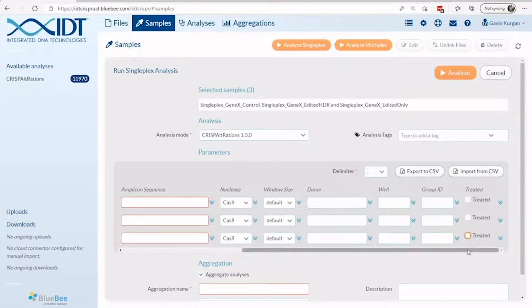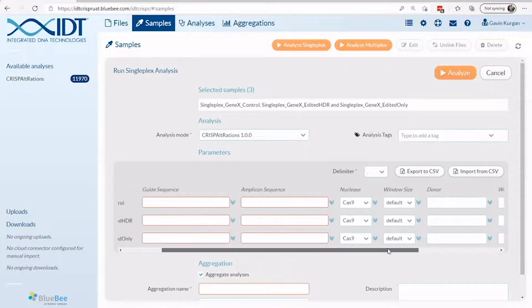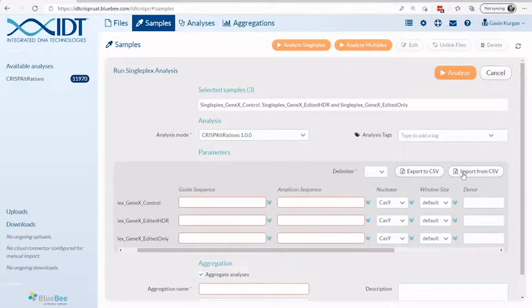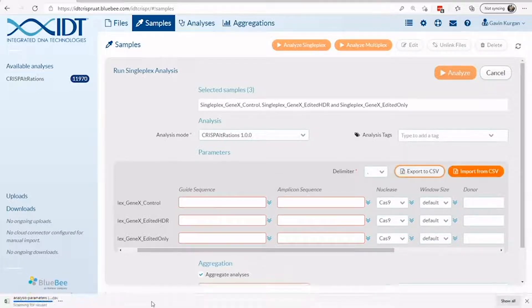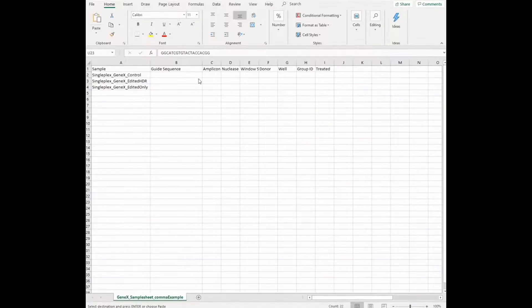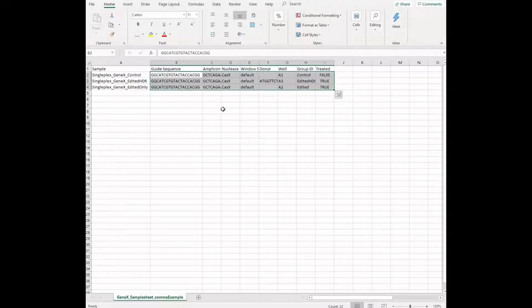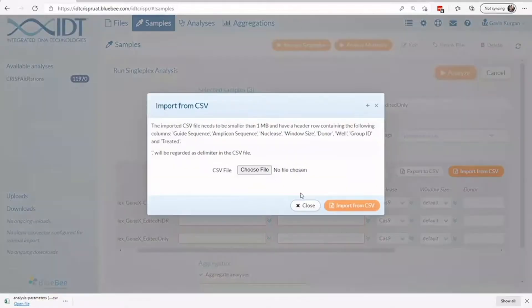For batch runs with a large number of samples, you will need to upload a sample sheet to provide run information. To get a template of this sample sheet, simply click the Export to CSV button. After specifying your sample information in Excel, you can save and upload this file directly into the interface.